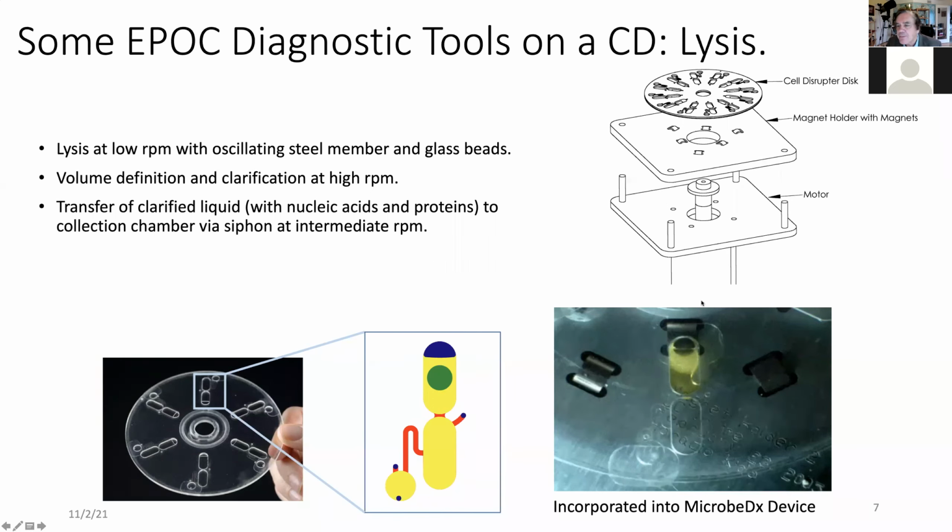Let's say this one. And now as this moves, this guy will be attracted to this permanent magnet. That means the disc will go up and down. And so now you can imagine, you see this happening, juk, juk, juk, juk. This is being pushed up and down because of these magnets underneath this plastic.